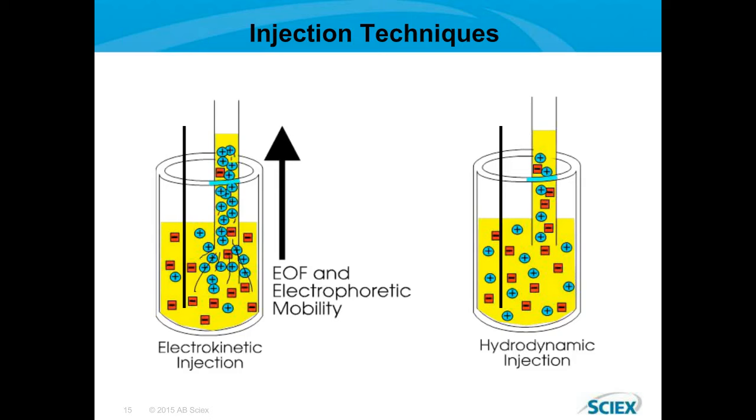The approach used in MSI work, multi-segment injection, is really a combination of a pressure injection along with a method called transient isotachophoresis. I won't go into what that is, simply to say that you dissolve your samples in an electrolyte, which allows a very precise focusing of your sample analytes. Those samples are reconstituted in 25 millimolar ammonium acetate, and each segment is injected, followed by a spacer.